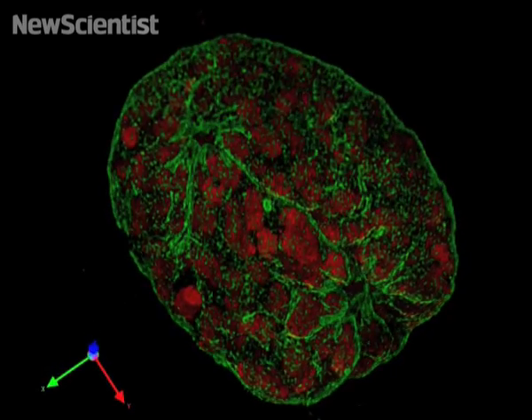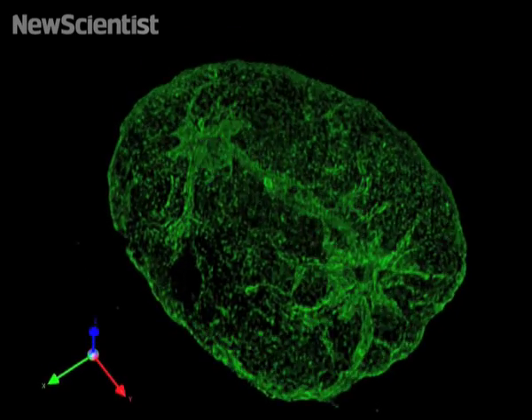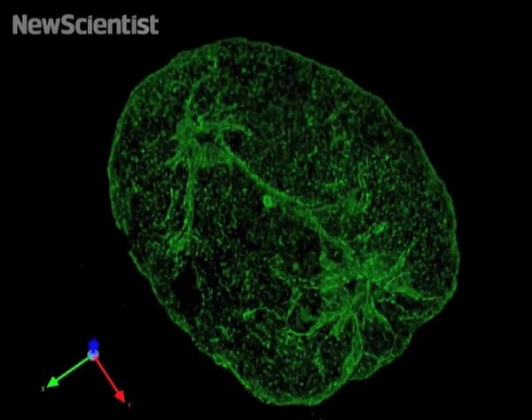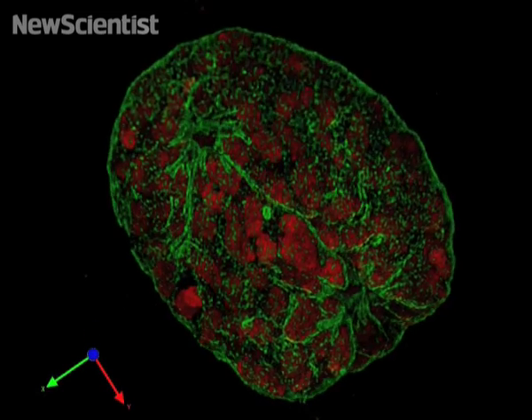The new approach might make it possible in future to study in much greater detail how chromosomes and other subcellular components are structured in space, and to distinguish, for example, DNA regions with active genes from those with inactive genes, an important step in understanding aging and various diseases.